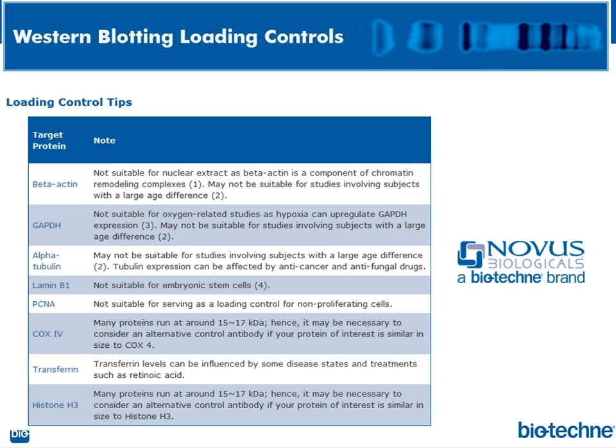You've got a membrane, and they've got the capture antibody. Think of an ELISA, if you will, classic sandwich ELISA. You've got the capture antibodies, instead of the bottom of a 96 well plate, bound to the membrane.